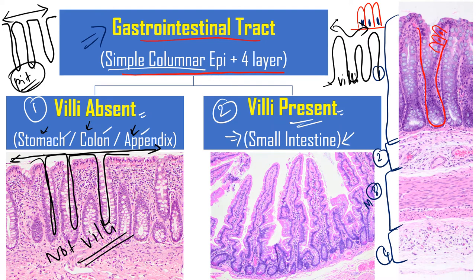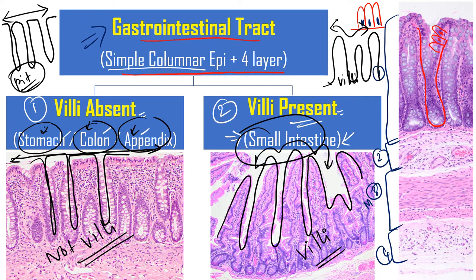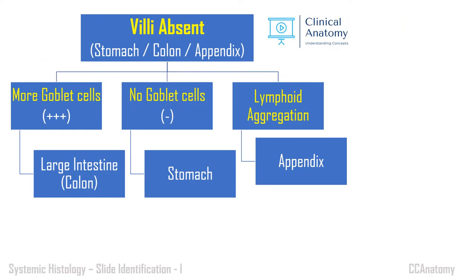For villi, they are finger-like extensions and the topmost region is slightly irregular — not smooth like pits. The luminal surface is a bit irregular — this is the typical feature of villi. If villi are present, it is small intestine. If villi are absent, it is not small intestine — it may be stomach, colon, or appendix.